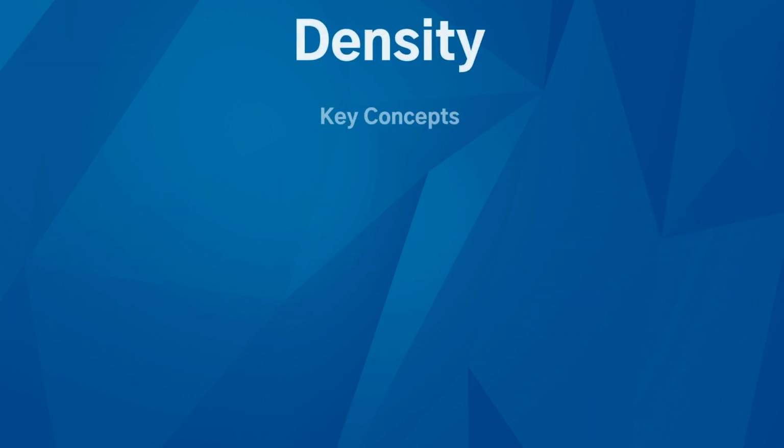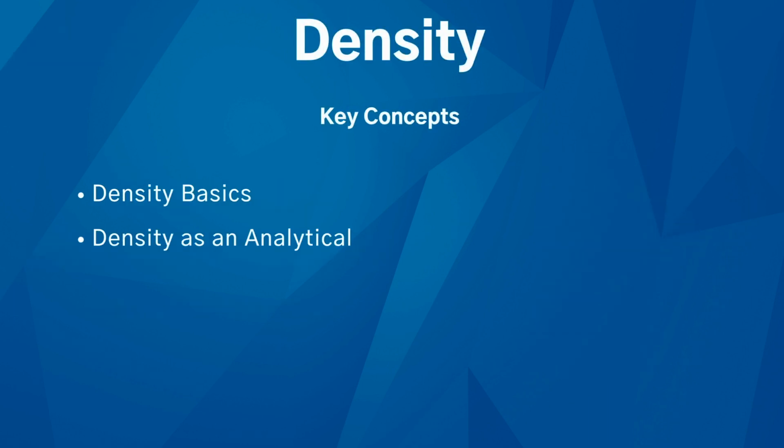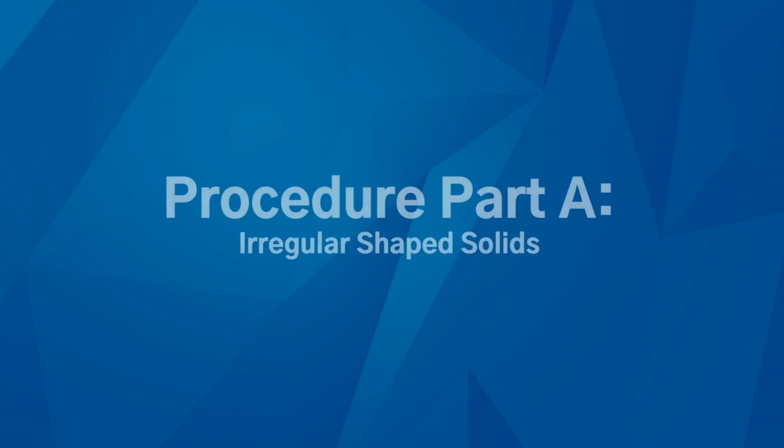Welcome to Lab E, Experiment 4, Density Determinations. We're going to look at density basics as an analytical tool, and we're going to use a calibration curve to determine concentration of an unknown.